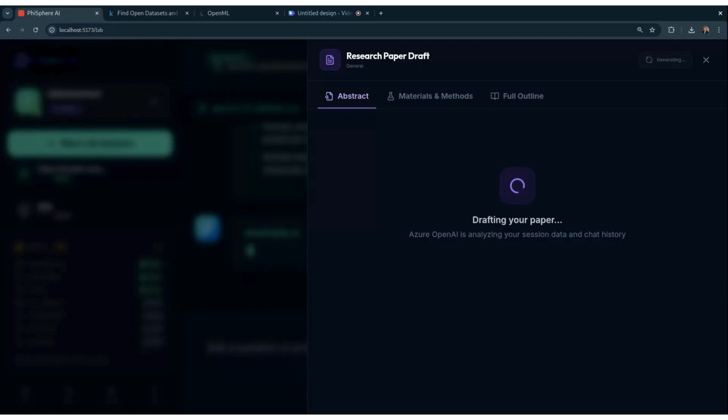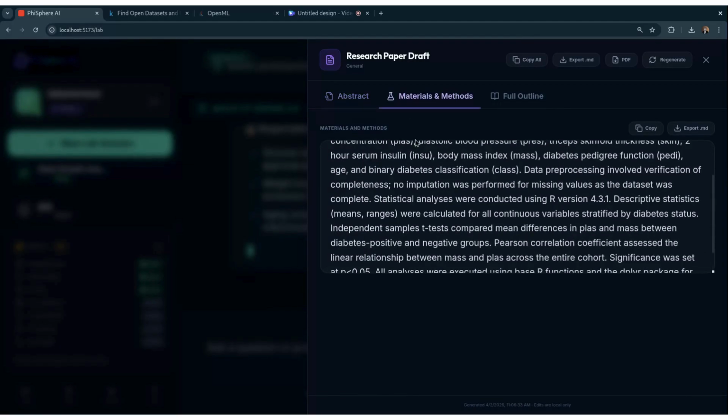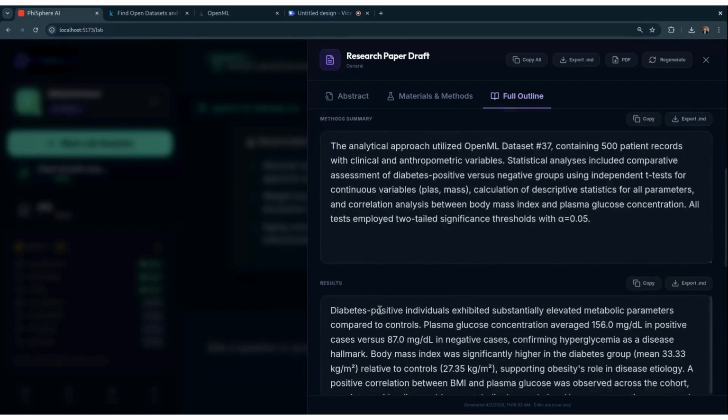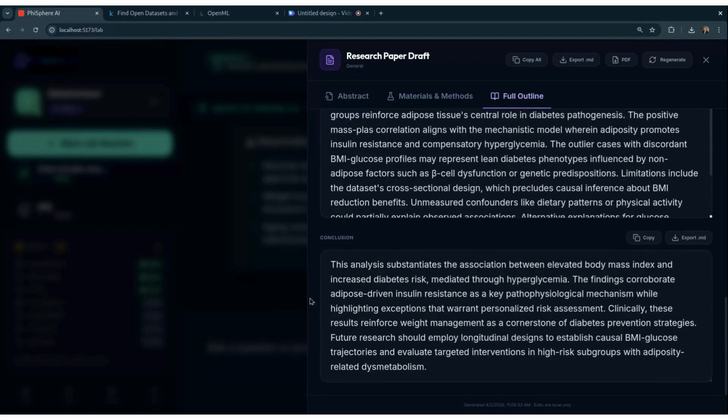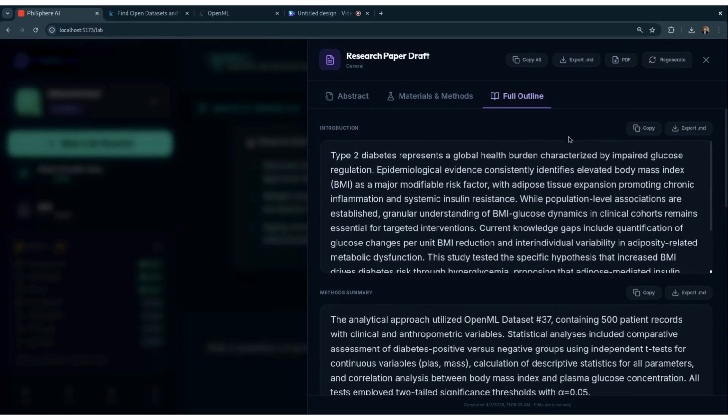Importantly, it also connects the recommendation to evidence. That is how it supports trust. When you see an AI experiment analysis output, you can say that it is not only describing what it thinks, it is explaining why it thinks it. The output is structured so that the reasoning is readable and reviewable.